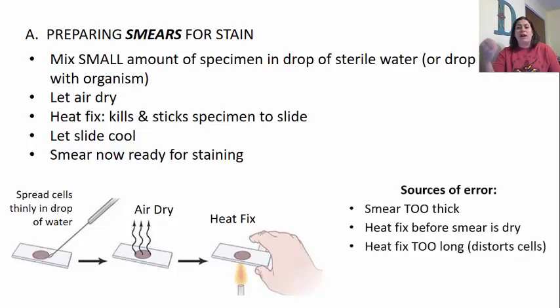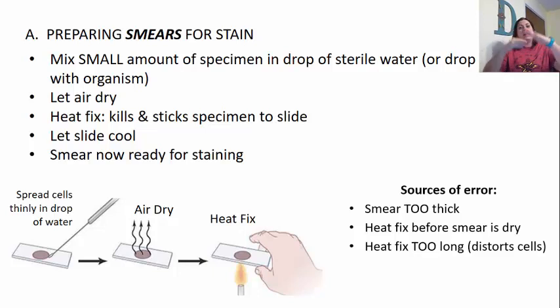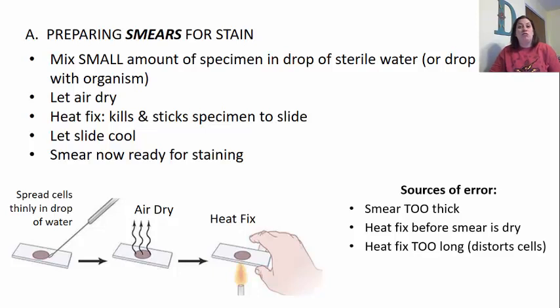There are several sources of error when preparing smears. One is that the smear could be too thick — too many organisms on the slide stacked on top of each other, preventing light from coming through to see details. Another source of error is heat fixing the smear before it's completely dry, which could alter the organism's structures. You also don't want to heat fix it too long, as the cells can get distorted and misshapen, making it hard to identify what kind of organism you're looking at.